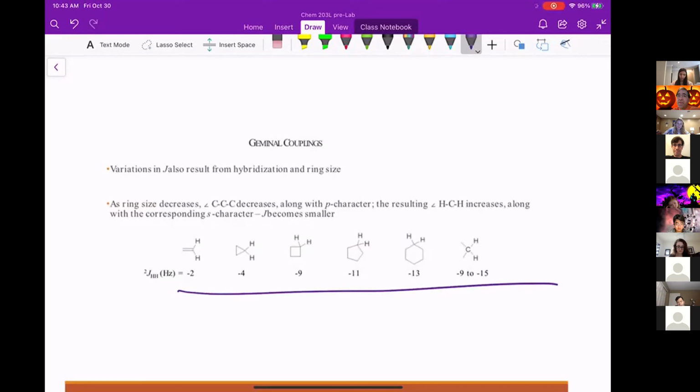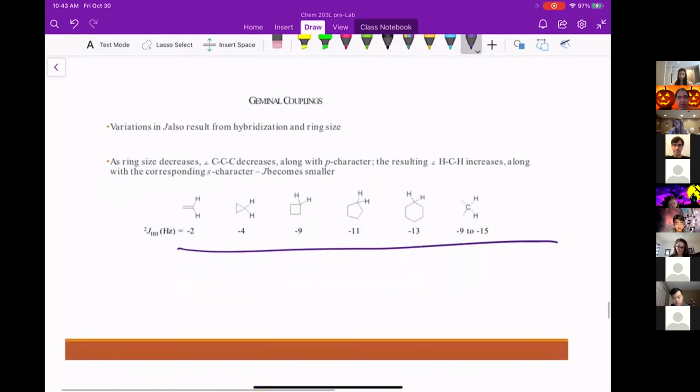I want you to know this effect is happening, and I want you to understand that we can extract a lot of information from the NMR, a lot more than we've done, and you will build on that in classes to come in the future. But as this was the place we introduced NMR, I want you to know some of the things that are happening and to explain why you see the 2 peaks in this week's NMR.